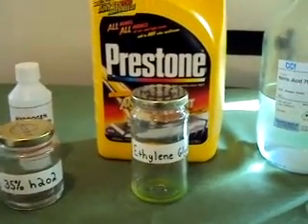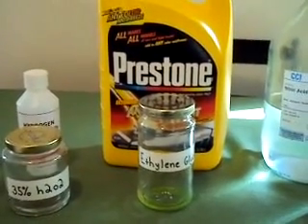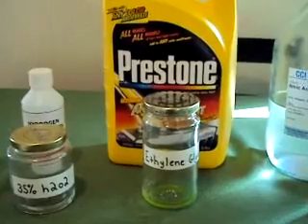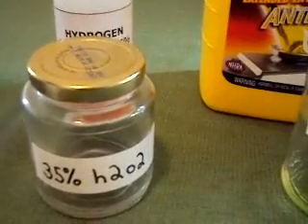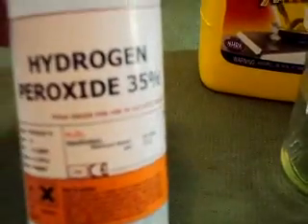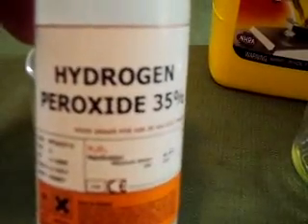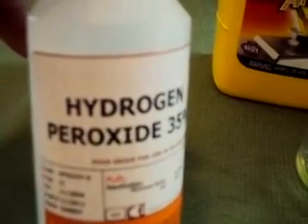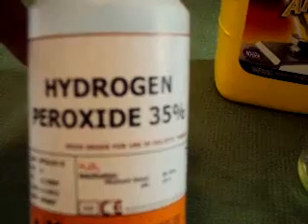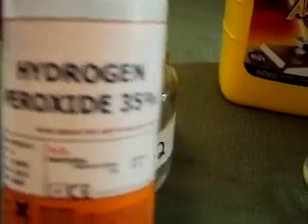I'm just going to briefly go over what is needed for this experiment and then I will take the materials outside and start. Here we have 35% hydrogen peroxide. It's basically food grade hydrogen peroxide. This is different than the 3% — it's stronger and you should definitely be more careful with this and wear safety gloves.